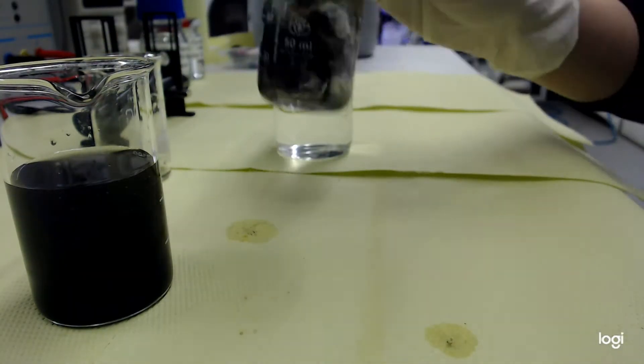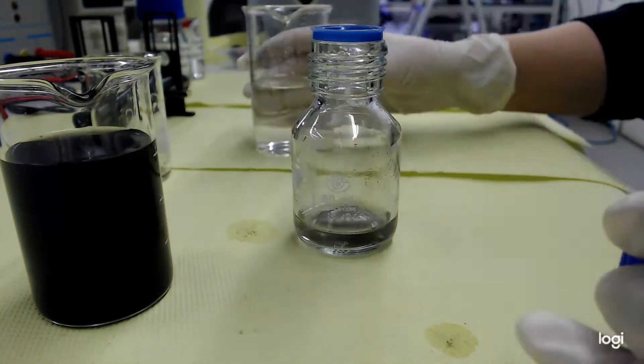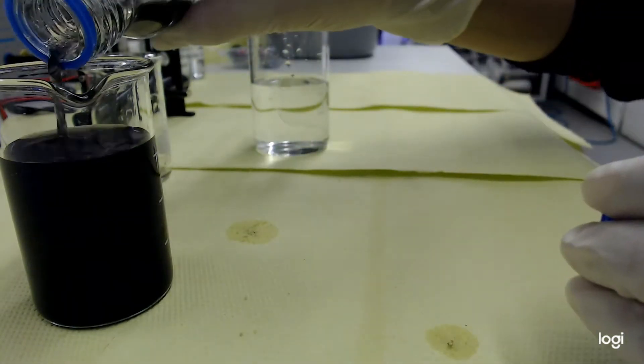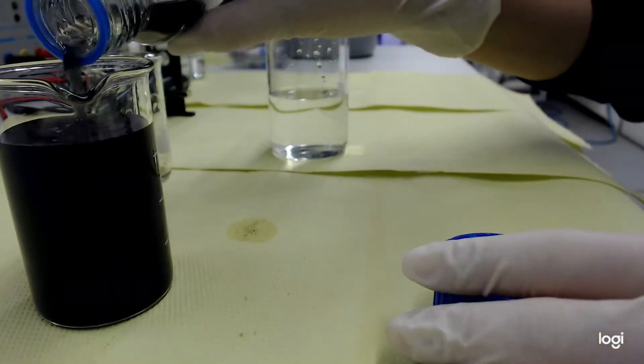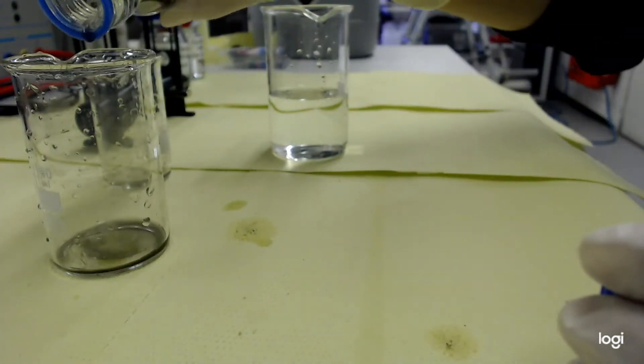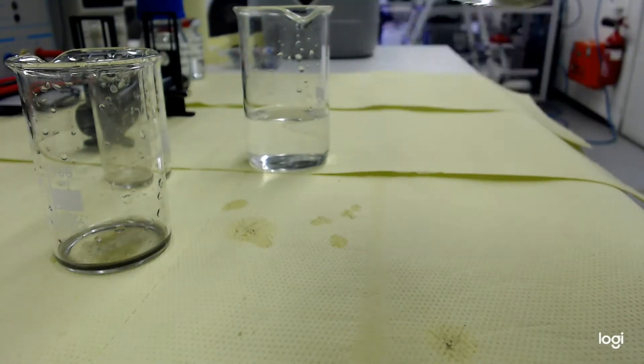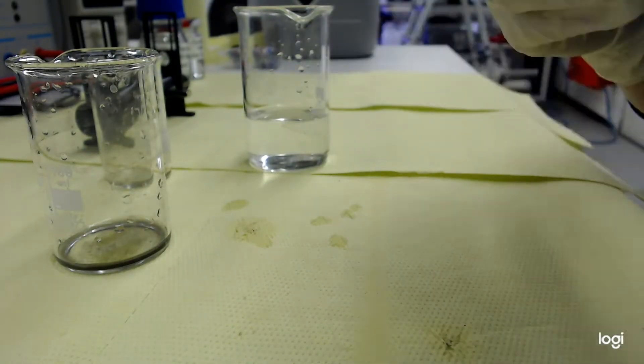From here on, the process is a literal rinse and repeat until the solution is clear, because then you know that all the excess powder and dust has been removed and the oversaturation of the Galinstan is no longer present.